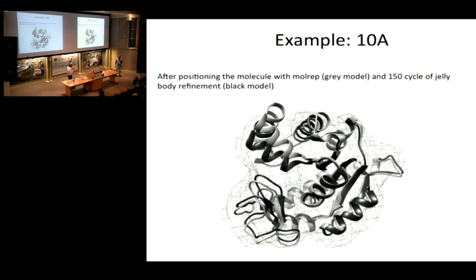And at the end, whatever you do, you have to go back to your observed maps and see whether the model describes the map, and whether the model is sensible enough to answer the question. All this refinement and everything else are just tools. What we want is to answer biological questions. If the model can answer my questions, then it was good. Otherwise, you have to do something else.